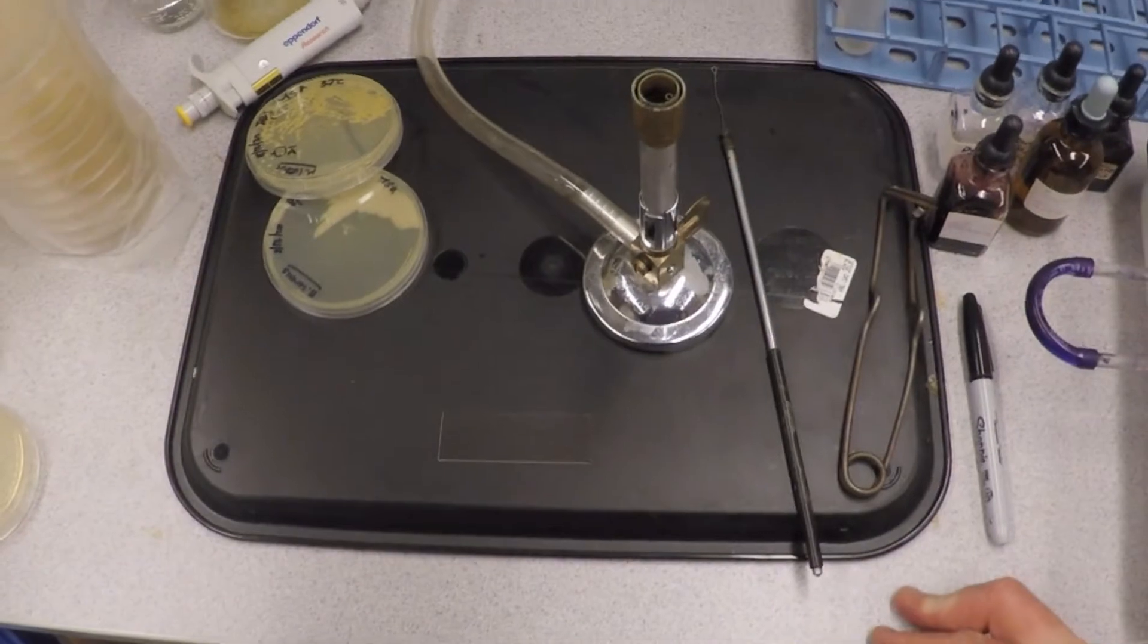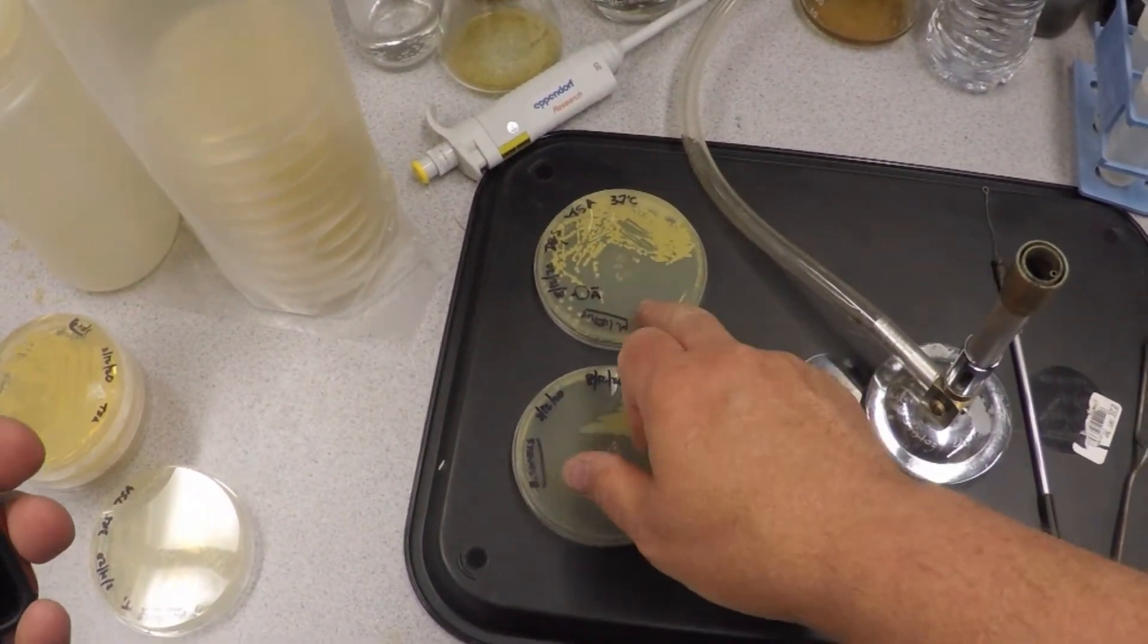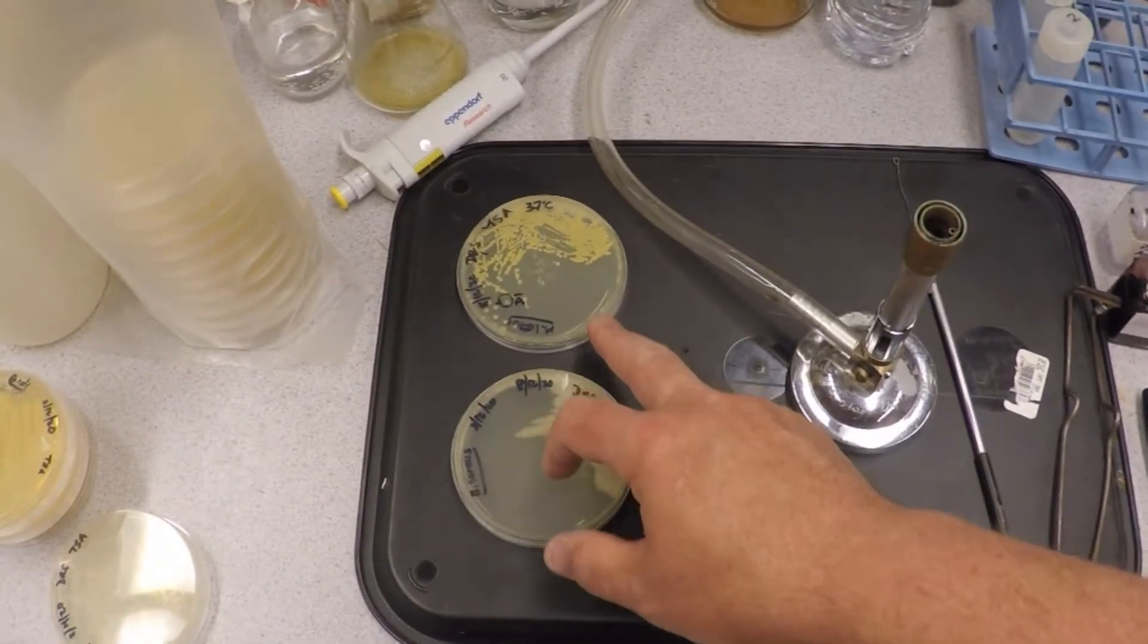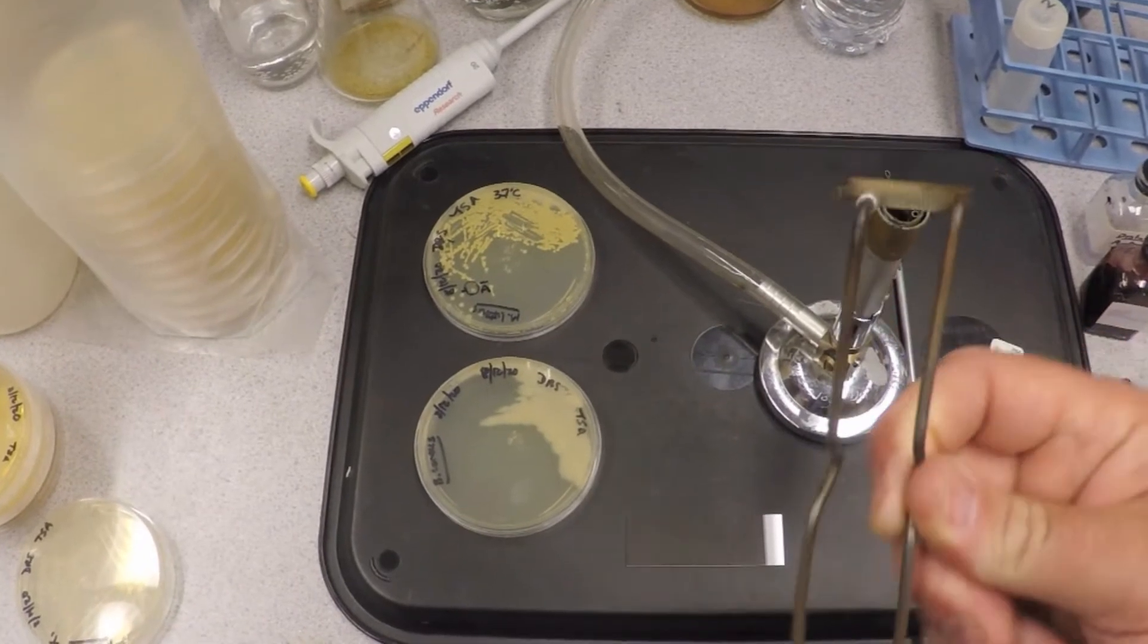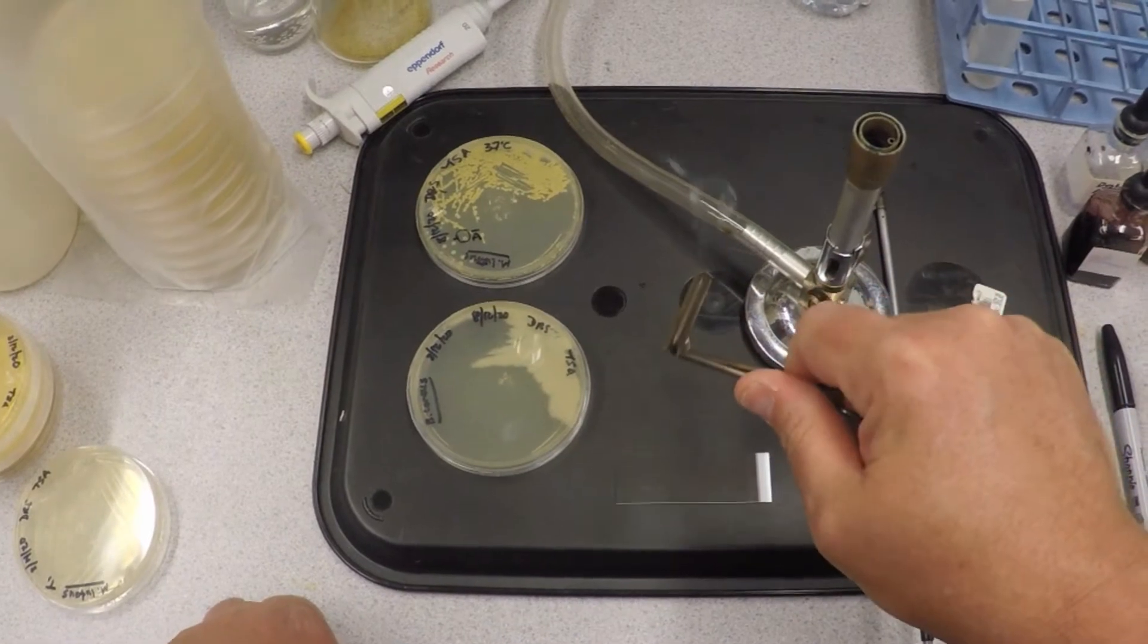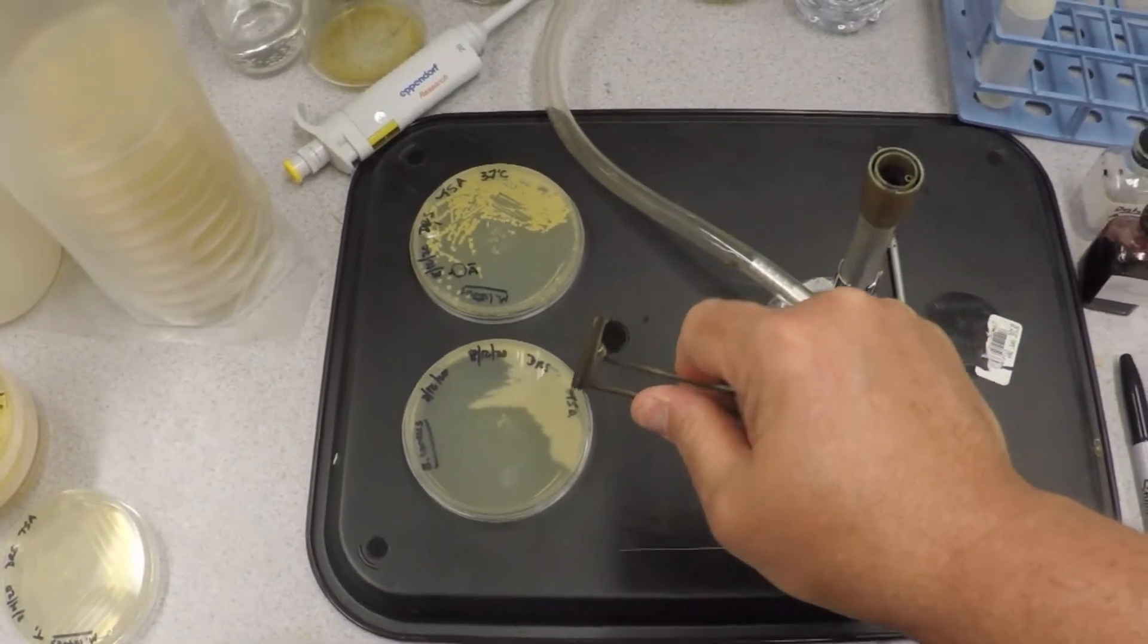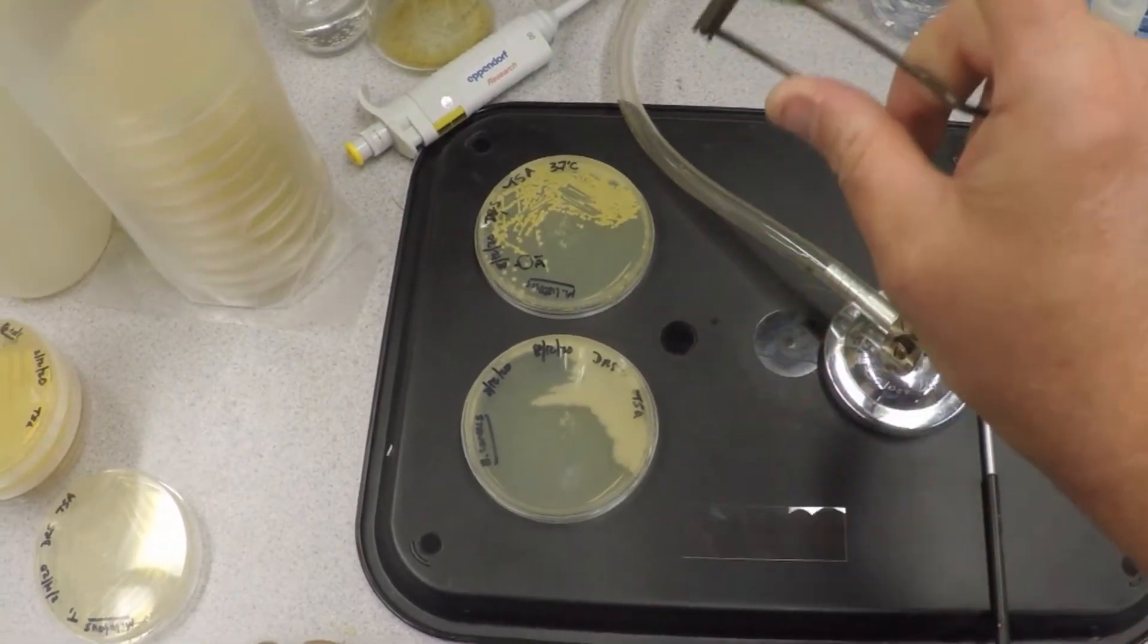Okay, so we're going to Gram stain some Bacillus and some Micrococcus luteus. What you're going to need is a flame, your organisms, a loop, and a striker. Remember the striker - if you do it just right you can get a smoke ring. Sometimes you can get them to go and put your finger through them.